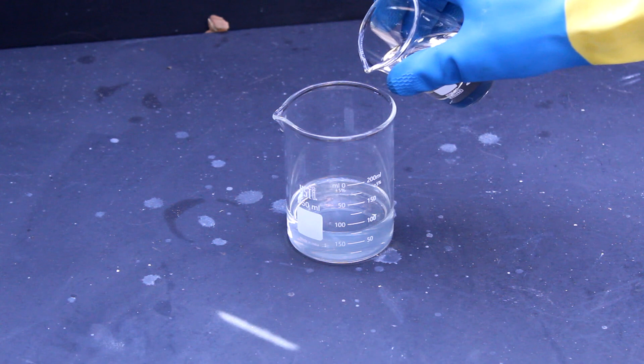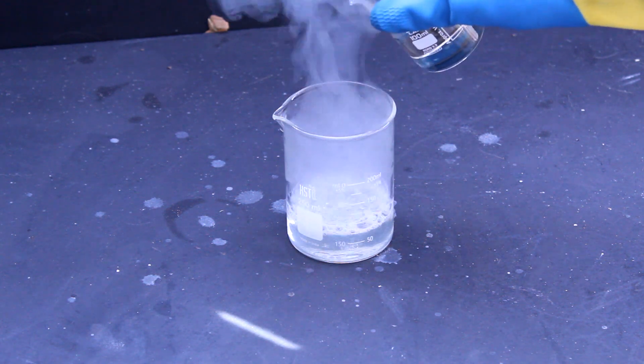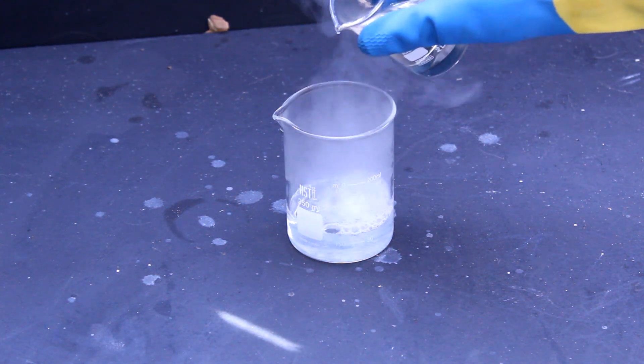As the acid is added to the sodium silicate, some carbon dioxide might bubble out, since some of the sodium hydroxide tends to absorb carbon dioxide, forming sodium carbonate.